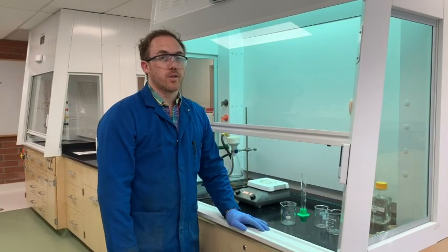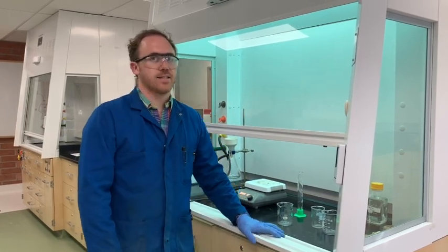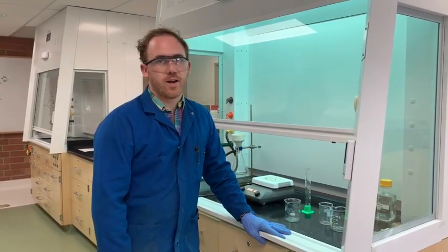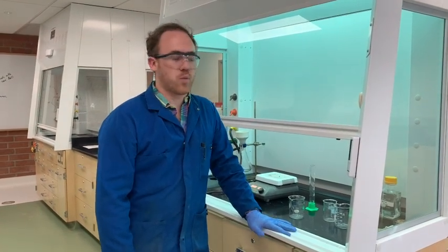Alright, so today we're going to do the azo dye lab. We're going to make a diazonium salt with sulfanilic acid, and we're going to then combine it with a little bit of 2-naphthol in order to give us the final orange dye that we're going to be making today as our final product.